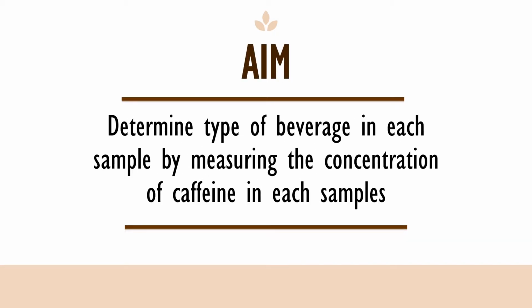You've seen the explanation on how VIS spectrometry works. Now let's move on to know how the experiment was carried out. The aim of this experiment is to determine the type of beverage in each sample by measuring the concentration of caffeine in the samples.